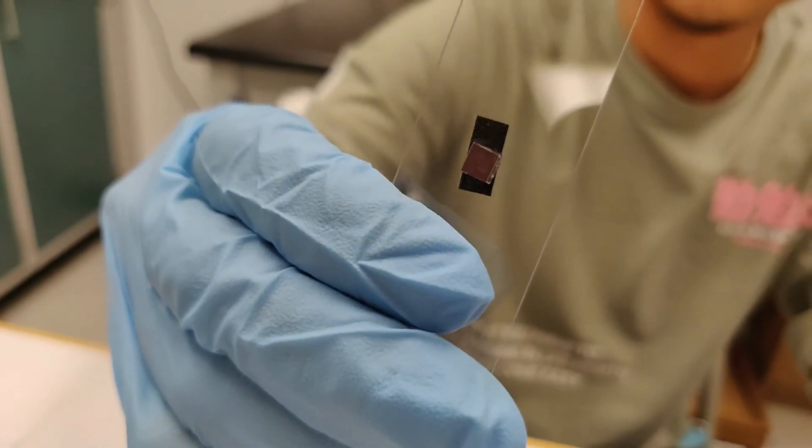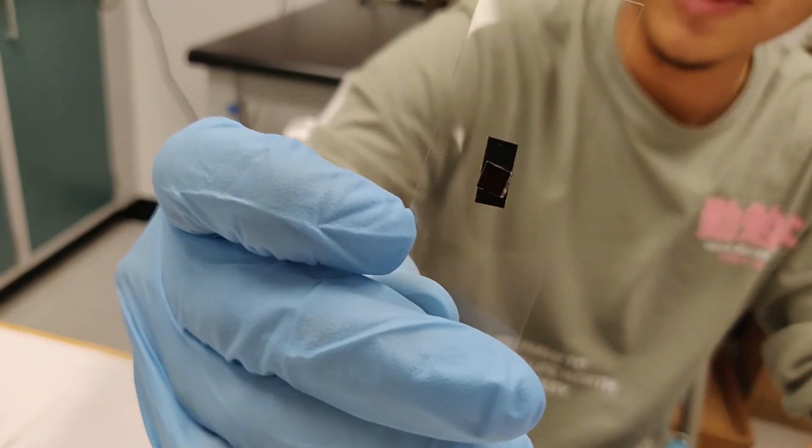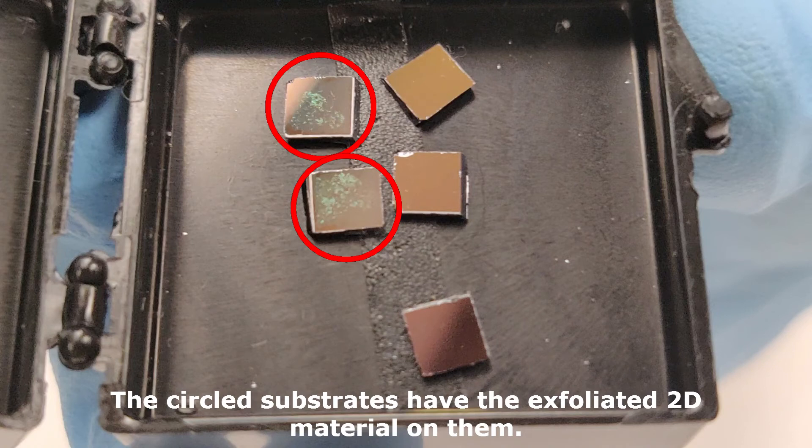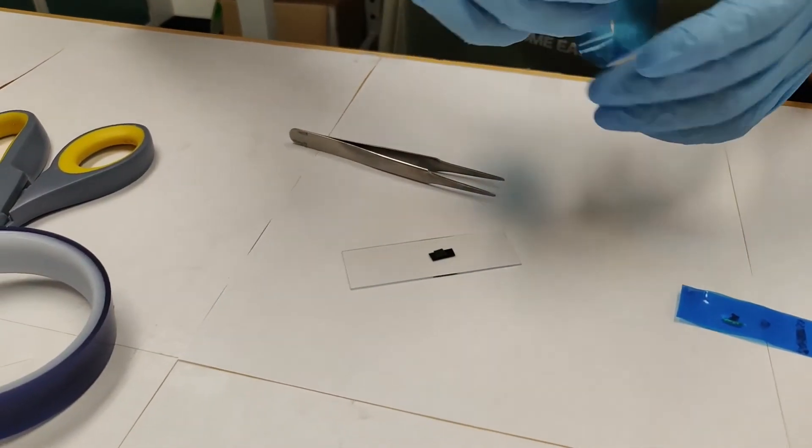Okay, so the 2D material is what's left behind on the substrate, right? Yeah, what's on the substrate right now is 2D materials. And that's the last step of the process.